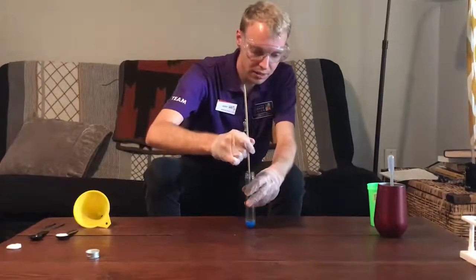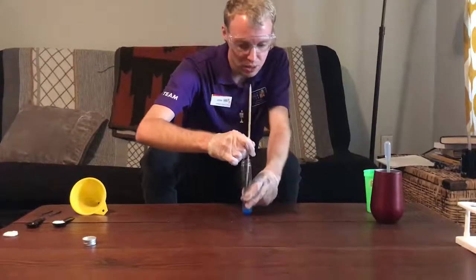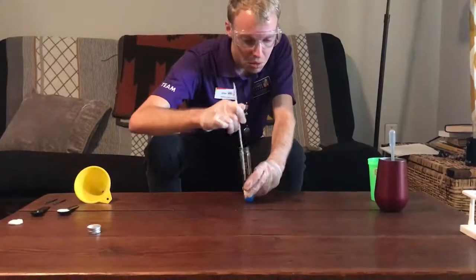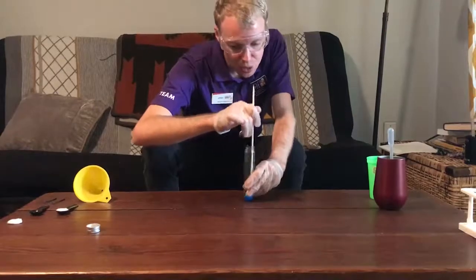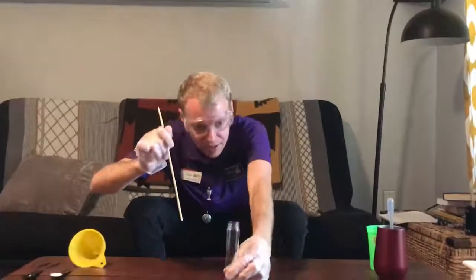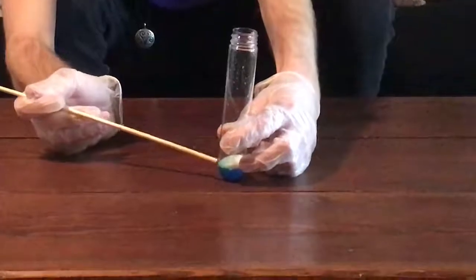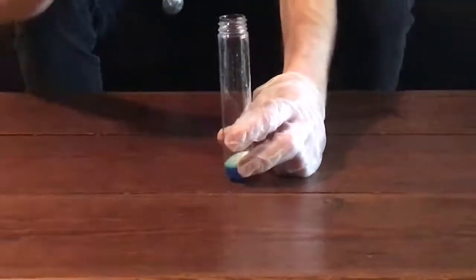So I'm going to take the flat end of my skewer and, to the best of my ability, push this cotton round down, as much as I can, until I get it to cover my copper sulfate, just like that. So I now have a bottom layer, which is our copper sulfate and water, and then the solid barrier, which you can see is already starting to absorb the water.